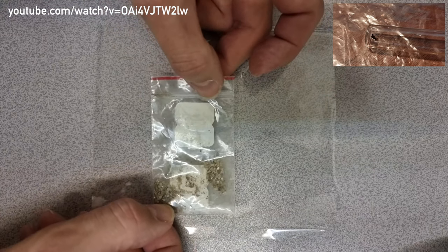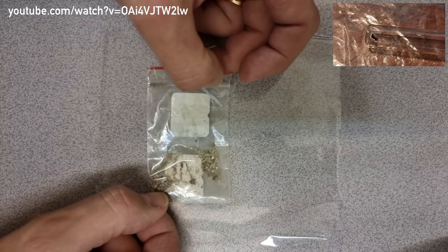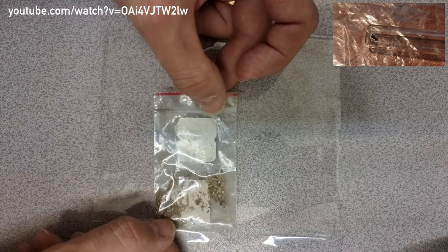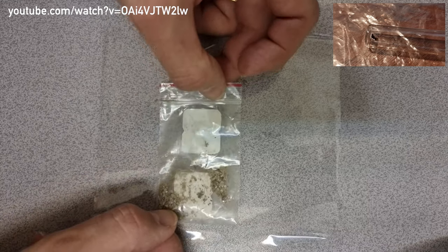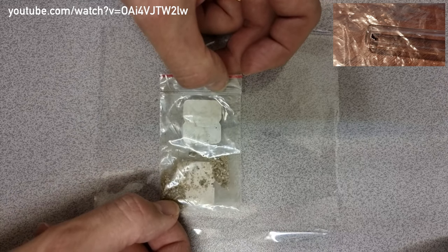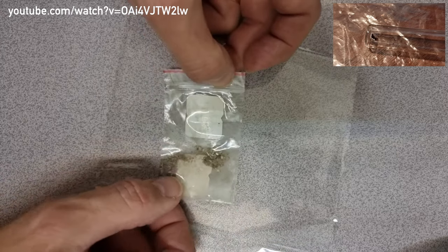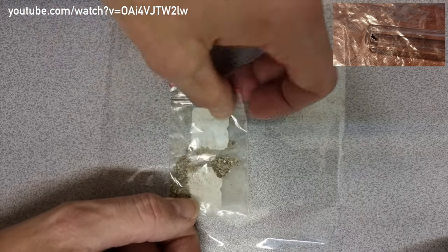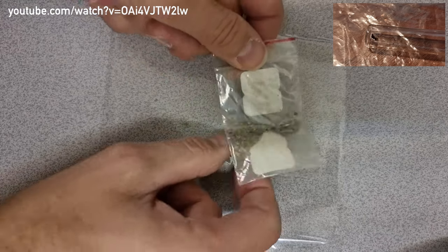So, wow. Now, the thing is, whilst a lot of the piping in the system is copper, I think the initiation of the heat generation system is actually using steel, the actual injector where the multi-phase injection is going in. And so if there's cavitation at that point, it could be extracting some steel. But wouldn't it be absolutely incredible if some of this material has iron-rich crenellated microspheres? Incredible or not? I don't know.